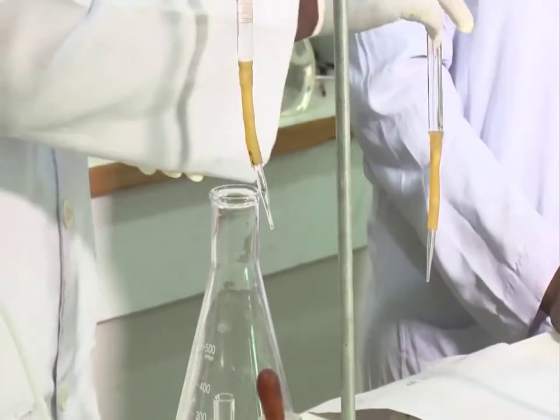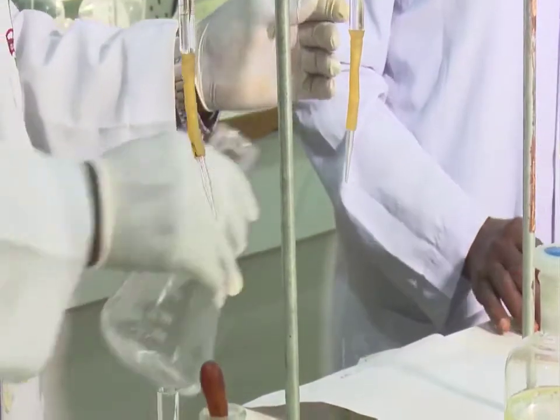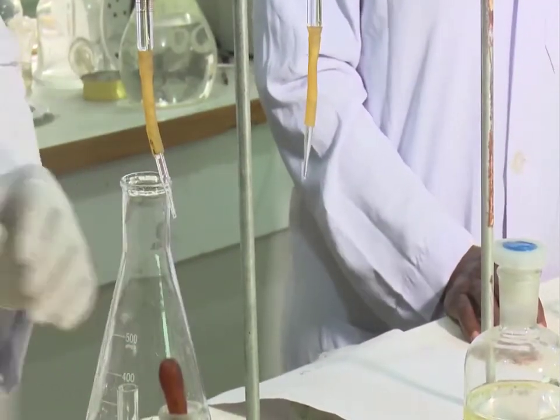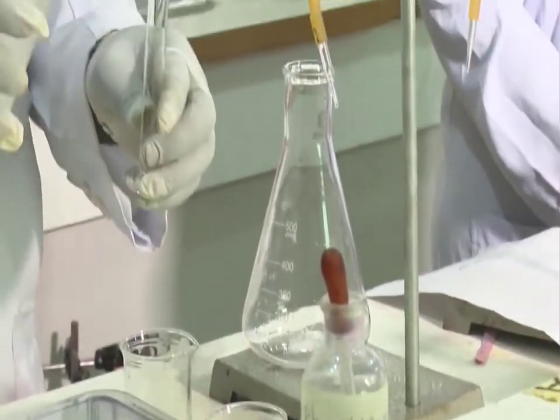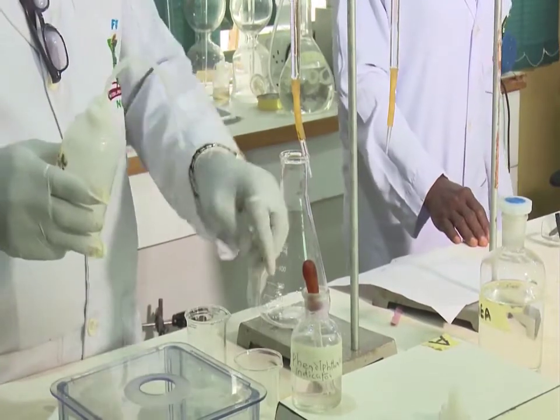To the vinegar sample, add 20 cm³ of distilled water and 4 drops of phenolphthalein indicator.